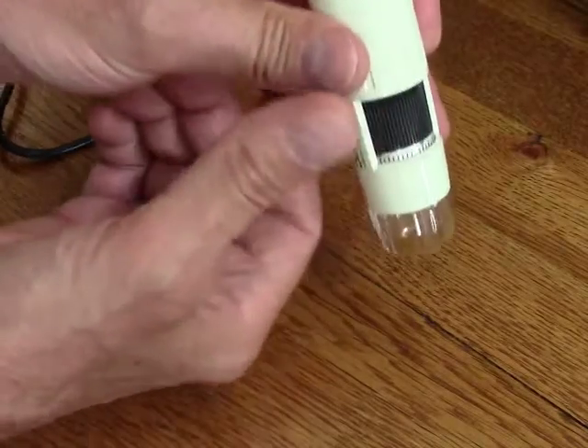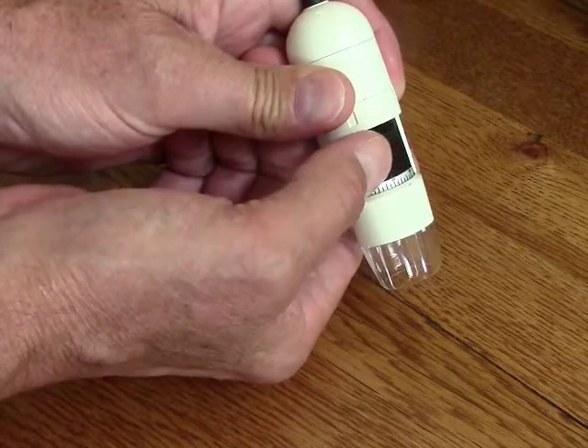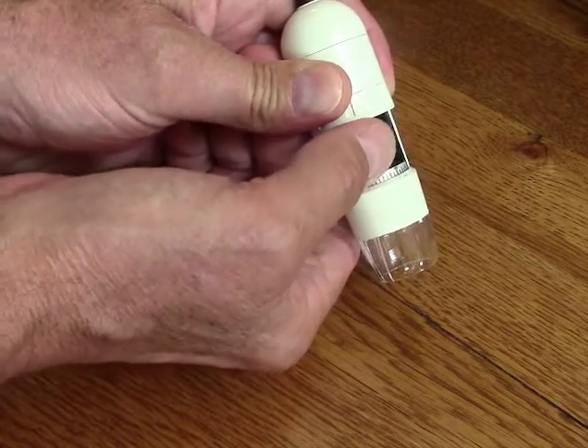It works best when you have some sort of a stand to put this in, in order to free up both your hands. But otherwise you have to hold it with one hand and then use this with the other hand to focus.